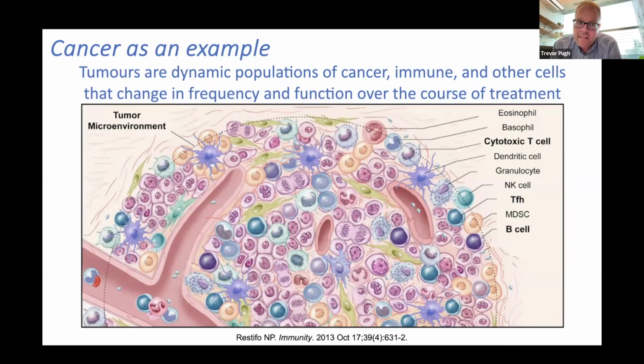Conceptually, they're very similar. I haven't actually used AB-seq myself, but I think the name implies that both are going to be using a DNA tag tethered to an antibody. So there are a few. This is also where it is challenging to pick which technology you want to choose. Sometimes there's a marketing term versus the name that's been used in the literature. So I haven't used AB-seq myself, but there are a few different brand names for the CITE-seq protocol.